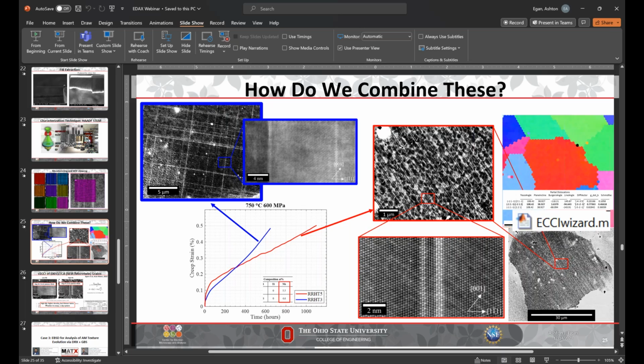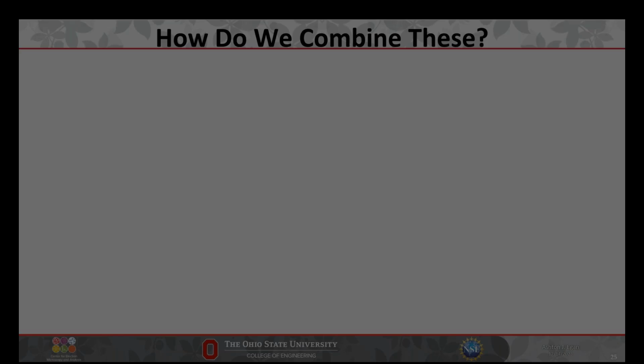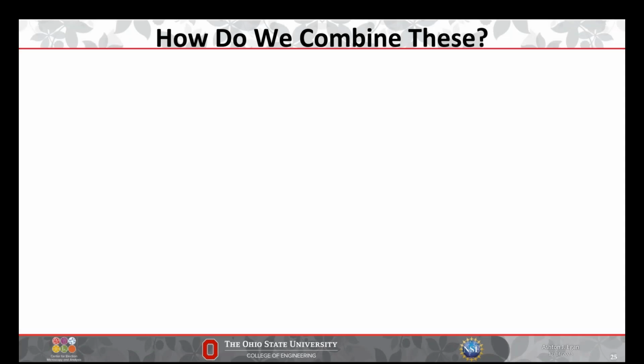Okay, just a few more questions. How important is it to have the accurate lift-out foil orientation for the atomic resolution TEM EDS analysis? And is it practically feasible during TEM observation?